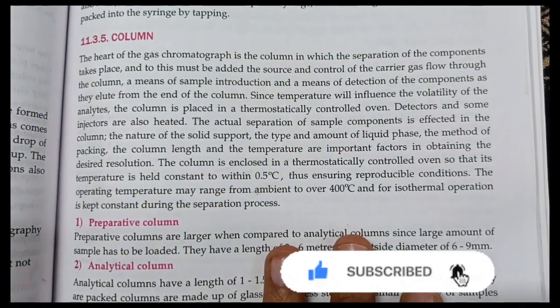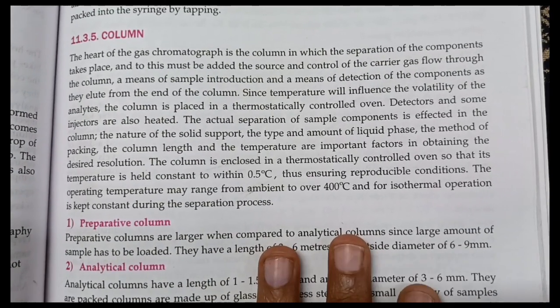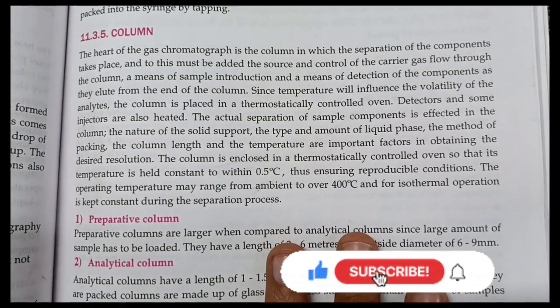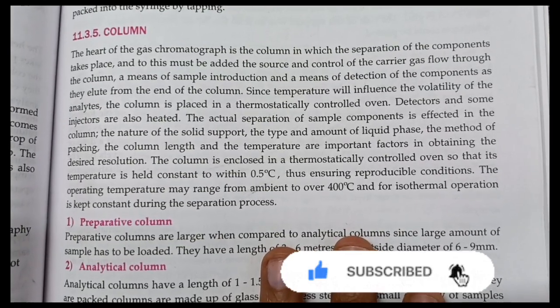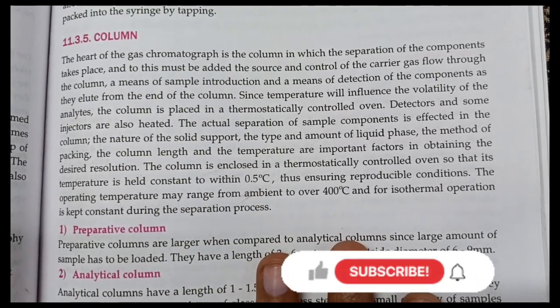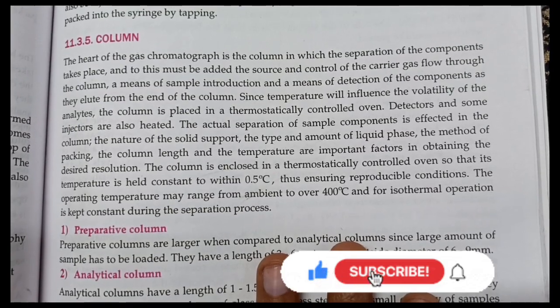Column. The column is the heart of the gas chromatograph. The column is where the separation of components takes place. To this must be added the source and control of the gas flow through the column, a means of sample introduction, and a means of detection of the components as they elute at the end of the column.